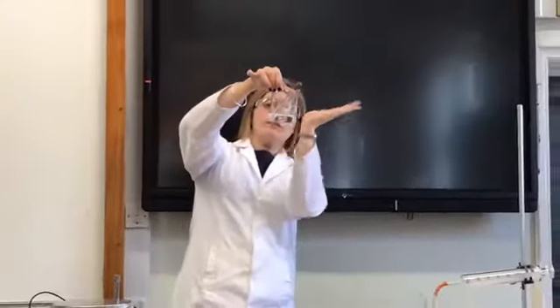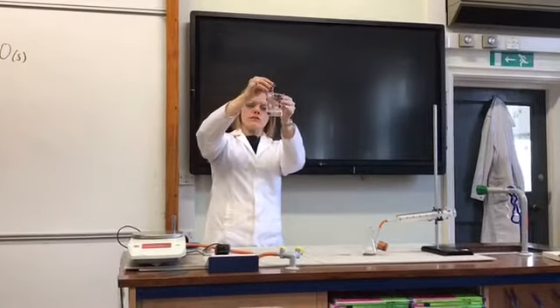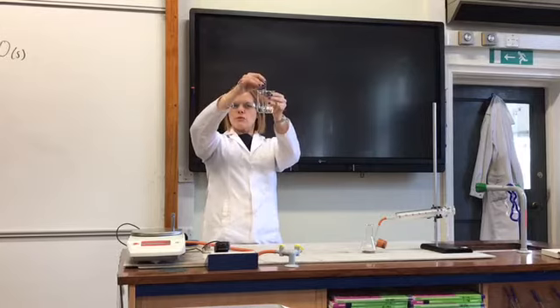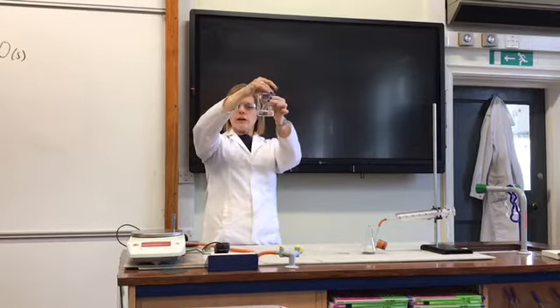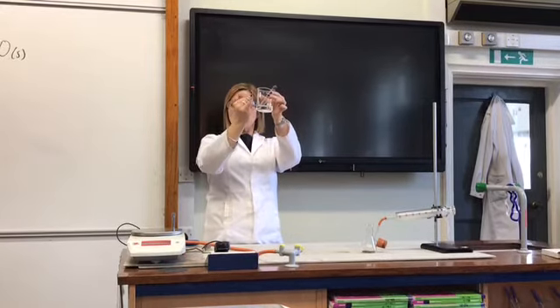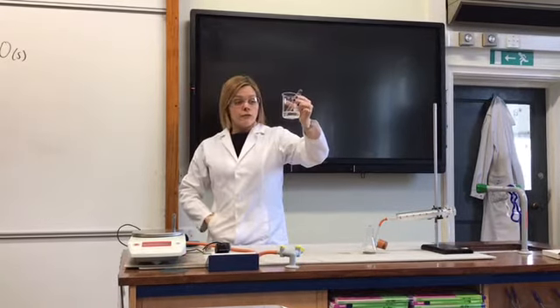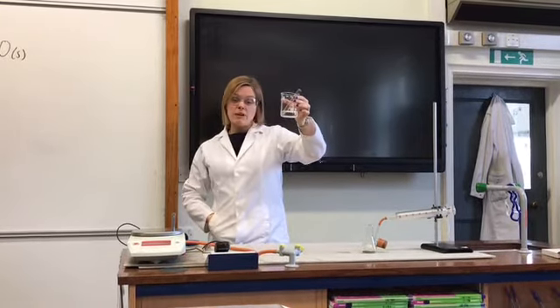Notice that I've tipped the tube to the side like so, because if it sits just flat like so, it can kind of form a bit of a seal on the bottom and stops the water from moving up. So putting it on the side allows it to take that water in over time. So I'll have to leave that now for a week probably and re-measure it.